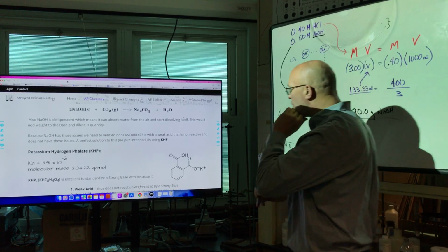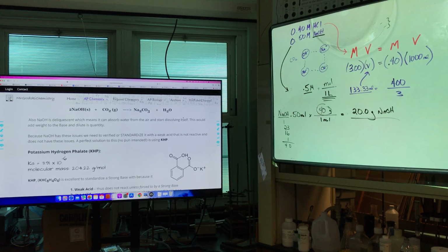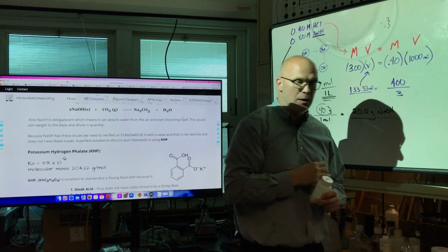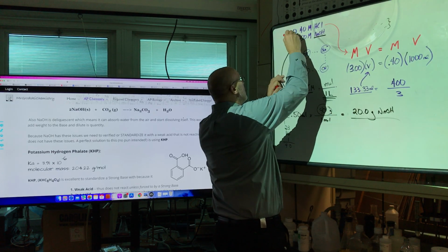Okay, now, party people. What we have to do now is, unlike the hydrochloric acid that I'm confident about, because I just opened the bottle and paid for the 3 molar concentration that I carefully diluted, assuming my skills of diluting and that math and measuring were correct, I'm very confident about this solution.